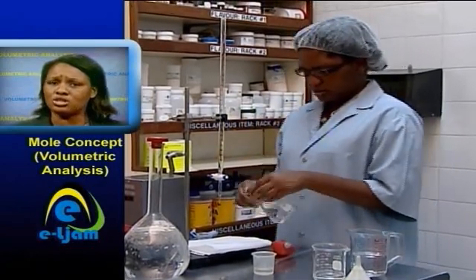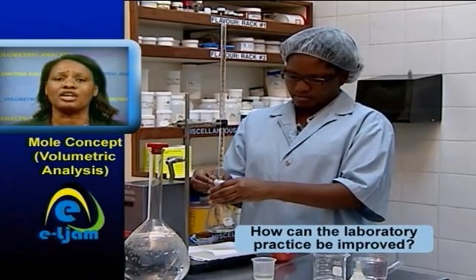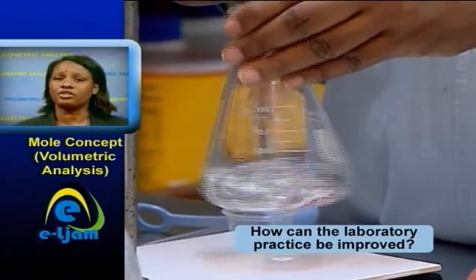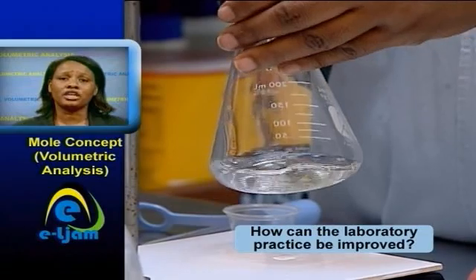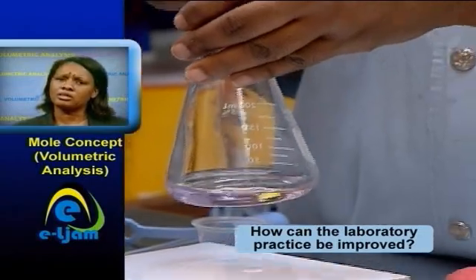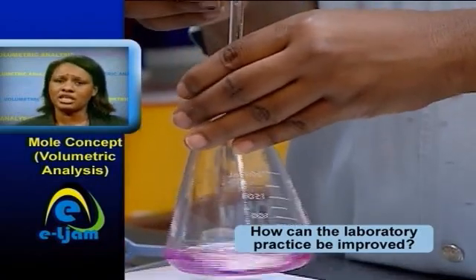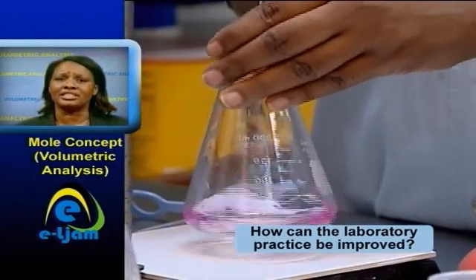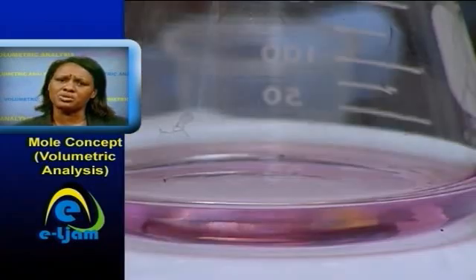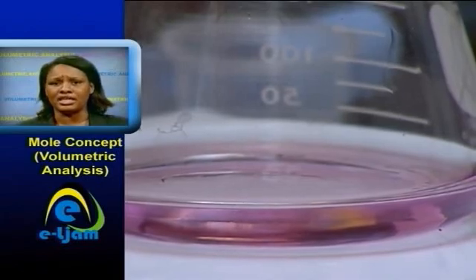Titration involves adding the solution from the burette to the solution in the conical flask until the reaction is complete. The substance being titrated is often referred to as the titrand. The point at which the reaction is complete is known as the endpoint. For acid-base titrations, it is the point at which no more neutralization can take place and is indicated by a distinct color change of the indicator. Indicators commonly used include screened methyl orange, and phenolphthalein.